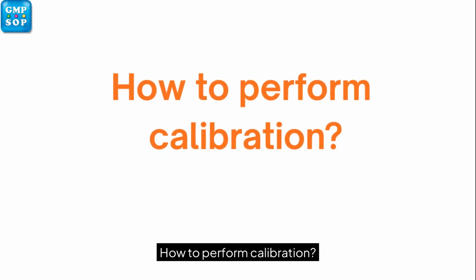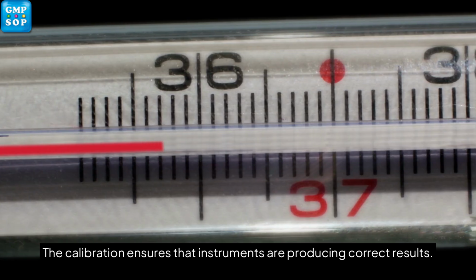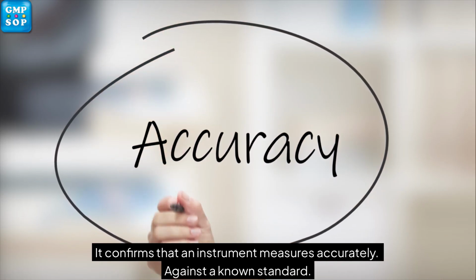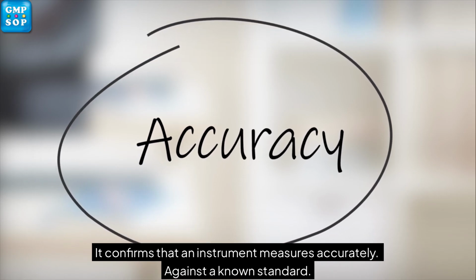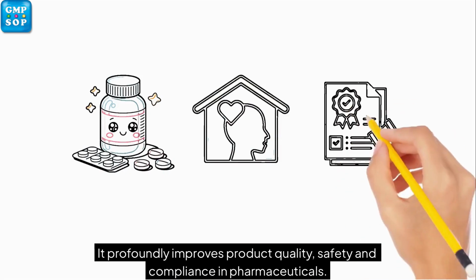How to perform calibration? The calibration ensures that instruments are producing correct results. It confirms that an instrument measures accurately, against a known standard. It profoundly improves product quality, safety and compliance in pharmaceuticals.